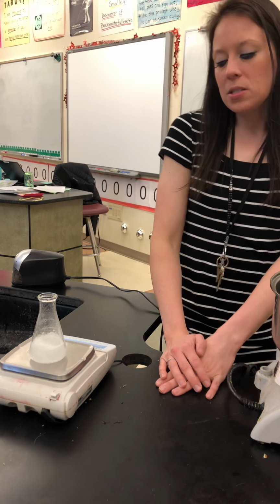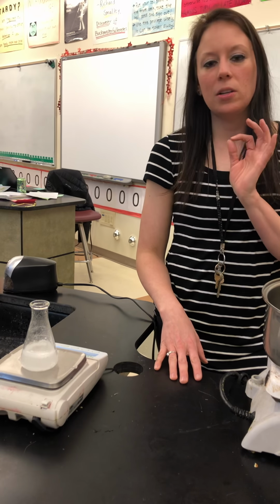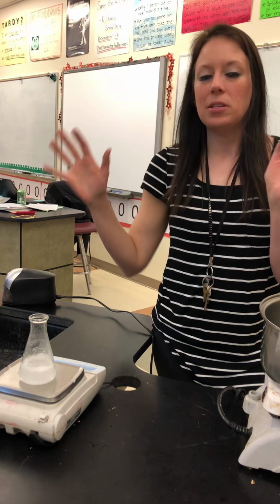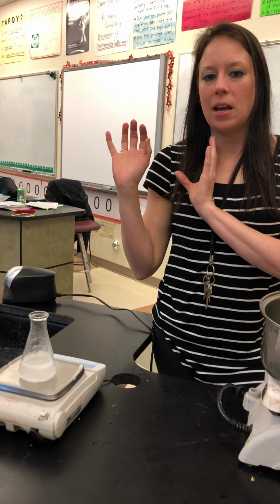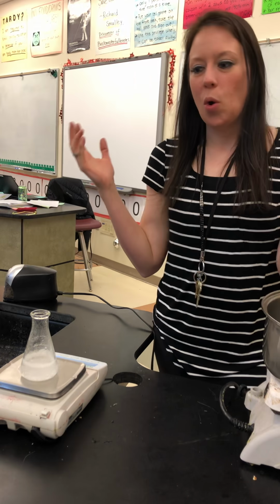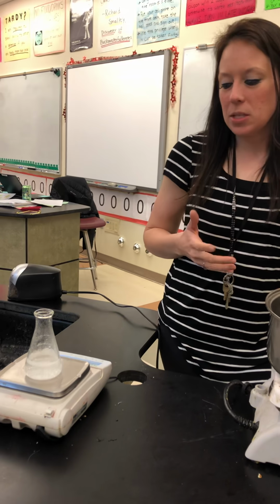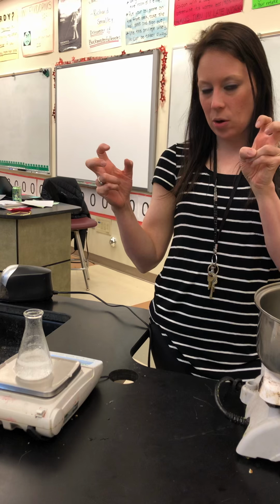So then what you're going to do with your calculations is determine what's called the theoretical yield. Assuming you've got 1 gram of citric acid and you know the reaction, and the balanced reaction I should say, determine how many grams of carbon dioxide is theoretically possible. So let's say that that comes out to be 1 gram. And we just showed in our lab that we released 0.5 gram. So that means we would have a 50% yield because we didn't get the perfect world amount.